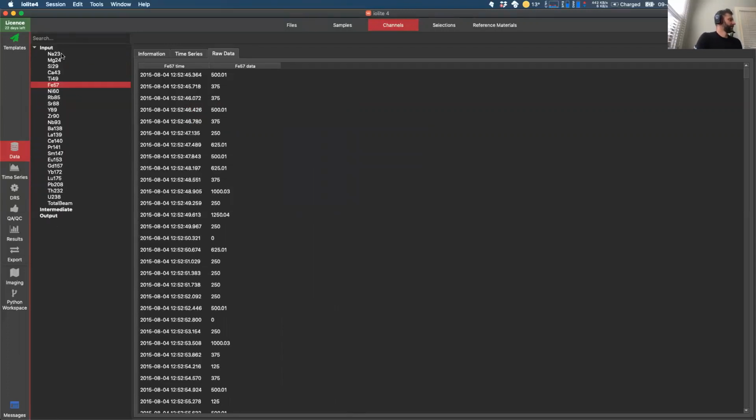And if you have lots and lots of channels, you can actually search for your channels up here by typing in here.